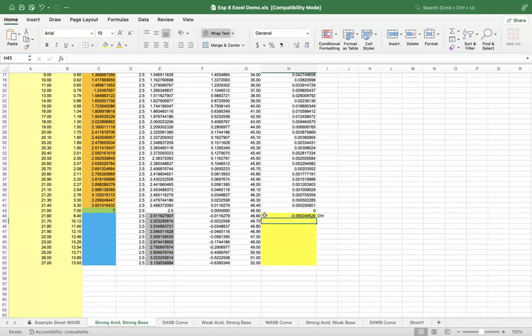And so we get this concentration, but it's negative. Two ways to fix it. One way is just to switch the order in which we subtract column D and column E. Here we were doing D minus E. We could easily just go E minus D. And now it's a positive number. And now, all of these are positive numbers, and these are all positive concentrations. We could do that. Or you can just multiply it by -1.